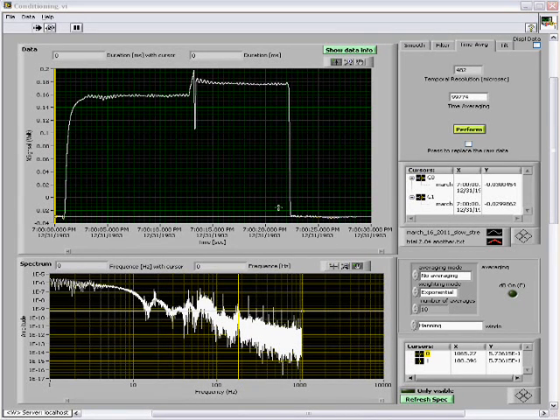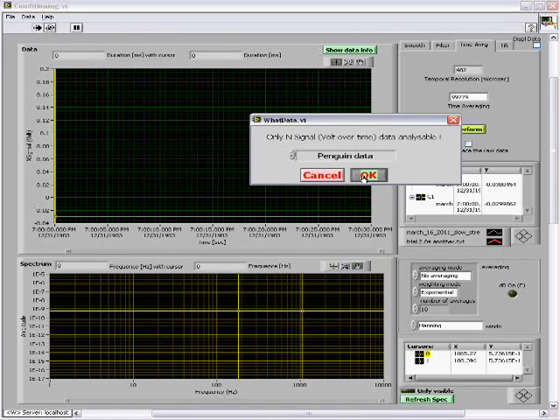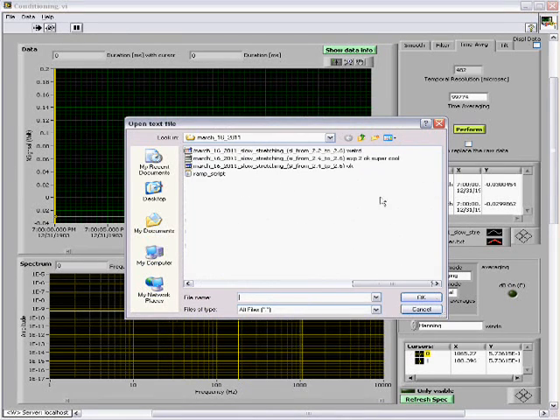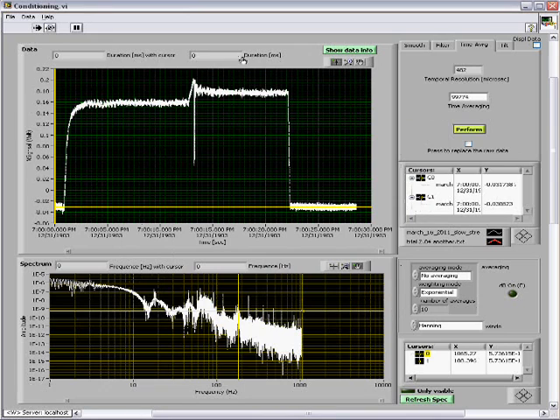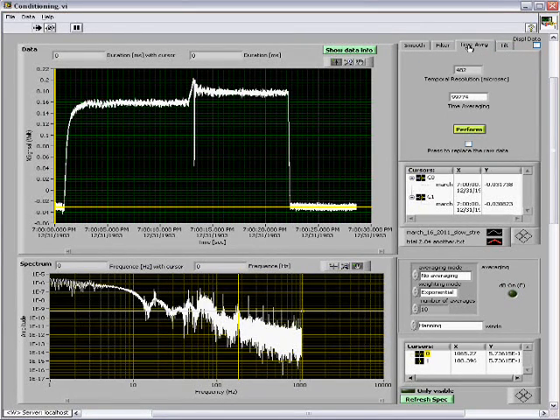In this video, I'm going to talk about this data conditioning module. The purpose of the data conditioning module is to take raw data acquired with the penguin, for example, and condition it, which means to smooth it, to filter it, or to time average it. In other words, it's to make it look better and get rid of some unnecessary signal, some noise from that data.